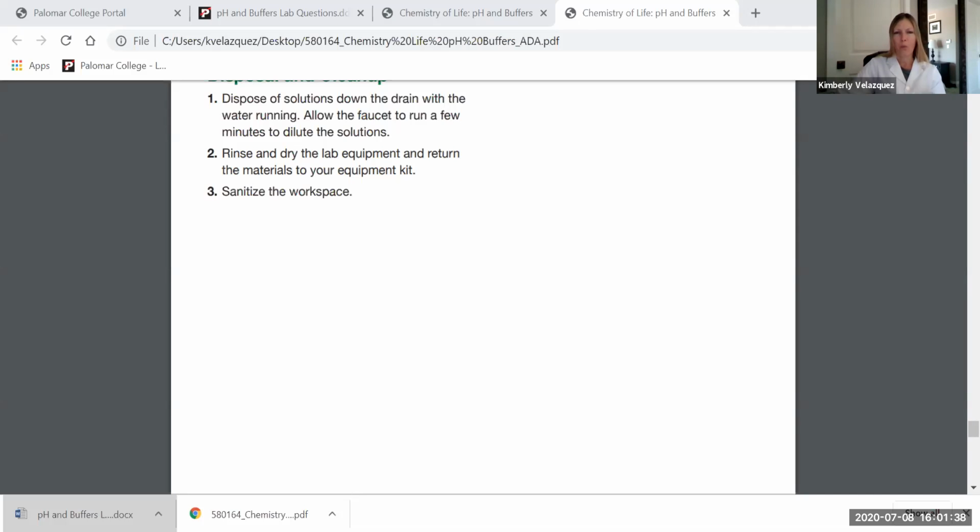Think about what you're exhaling. What gas is that you're exhaling? Okay, so we breathe in oxygen, we exhale. I won't tell you, but you should know. And so think about what that chemical is that you're exhaling, and is that an acid? Is it a base? When you're discussing how the pH changed. Again, photos. So for part 3, you're going to have a photo of the beaker with the water and pH indicator before blowing bubbles. So that's your control, and then after blowing bubbles.